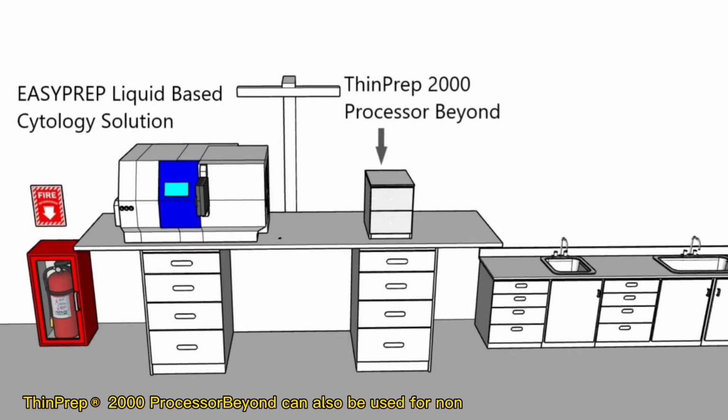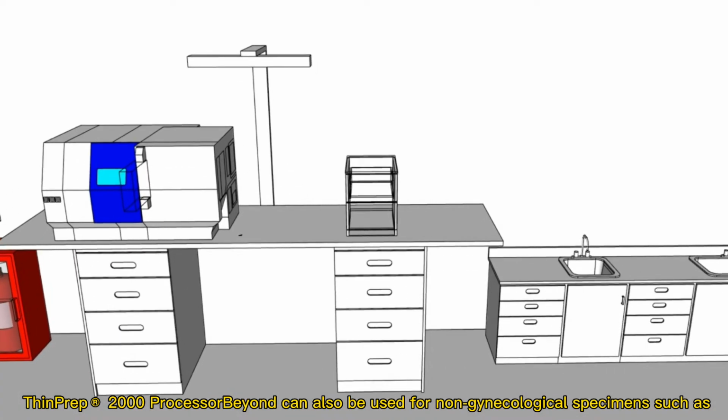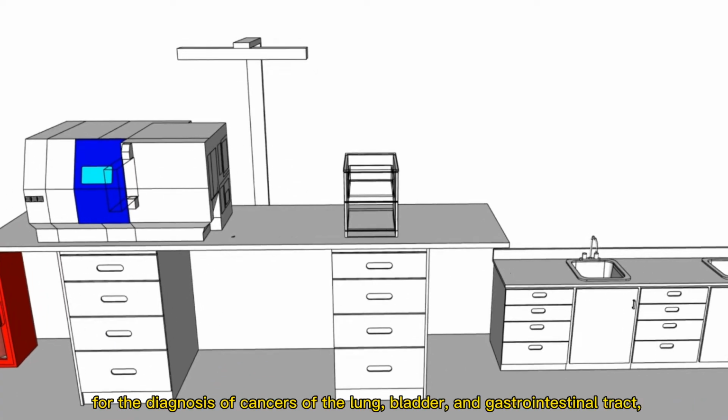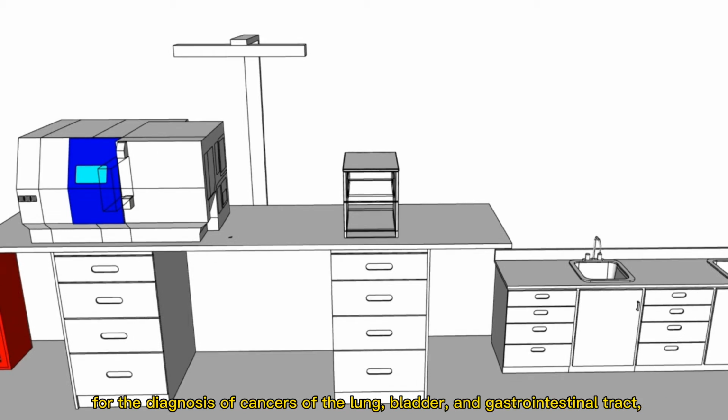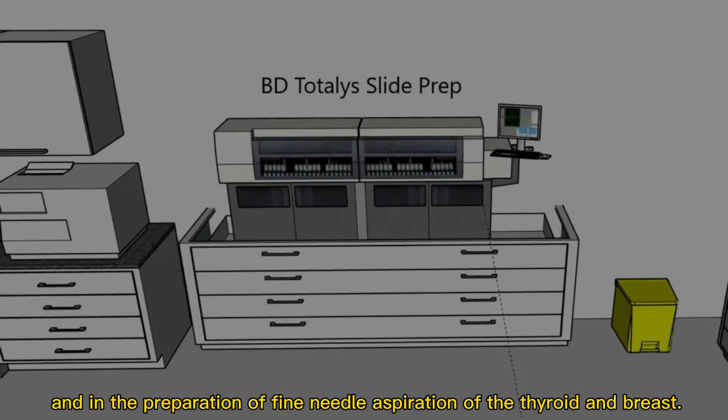Like the gynecological department, this department also contains special equipment to process the sample arriving. The ThinPrep 2000 processor can also be used for non-gynecological specimens, such as for the diagnosis of cancer of the lung, bladder, and gastrointestinal tract, and in the preparation of fine needle aspiration of the thyroid and breast.